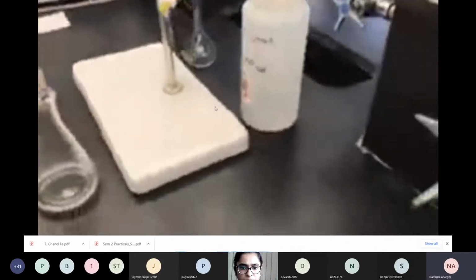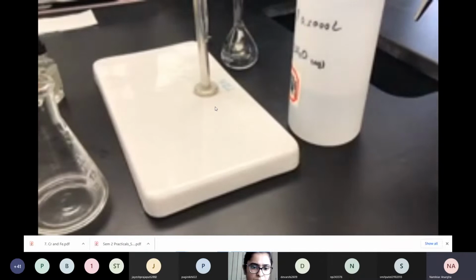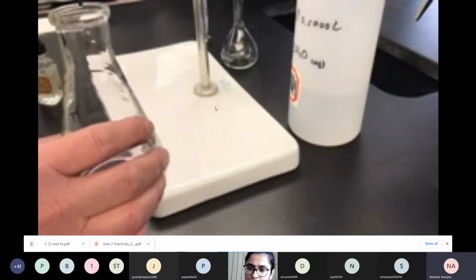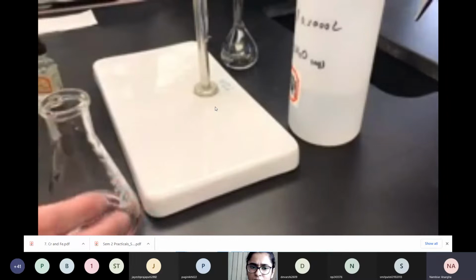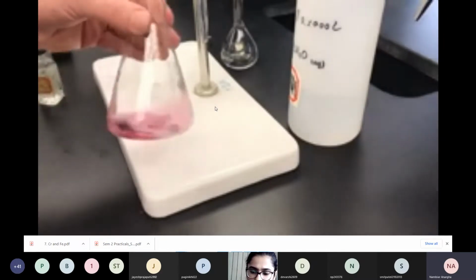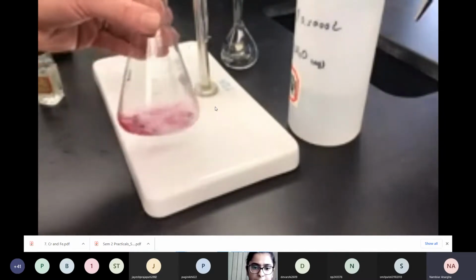So at this point, I'm going to set the camera up here close by so you can see the titration. And I'm going to go ahead and add the last couple of reagents that we have to put in. So the next thing I'm going to put in is going to be 5 drops of the Eriochrome Black T indicator. As you can see here, that's a very pretty red solution. And there's a 5th drop, just in case. All right, so I'm going to stir that up. You can see what that looks like. Looks like sort of a nice bright pink or reddish pink solution there.